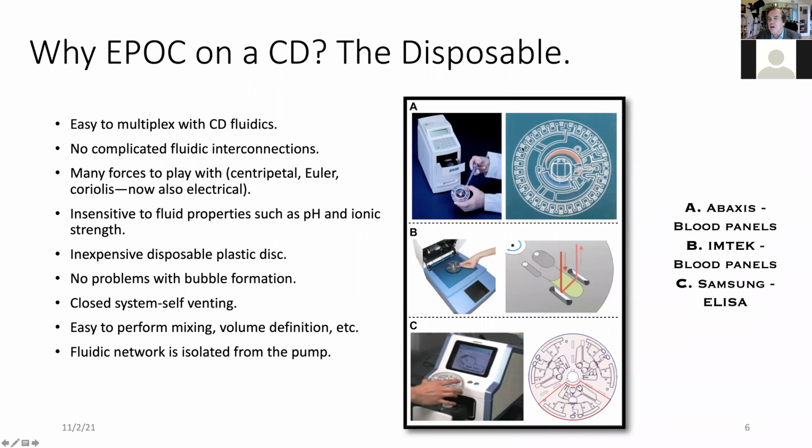You see all of these similar elements. These are repeats of the same test. In other words, I multiplex a whole bunch of analyses on that platform. I also don't need any tubing to put things together. The tubing is embedded in these plastic channels.